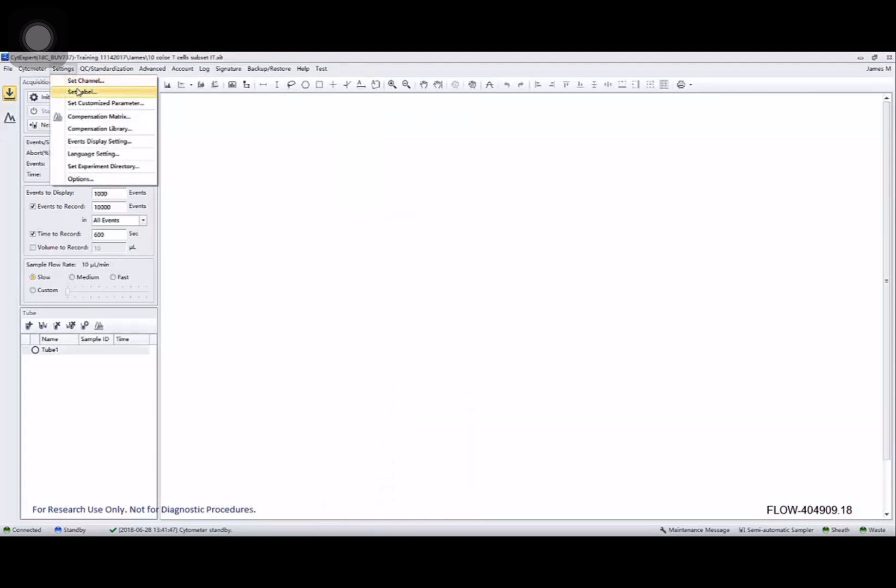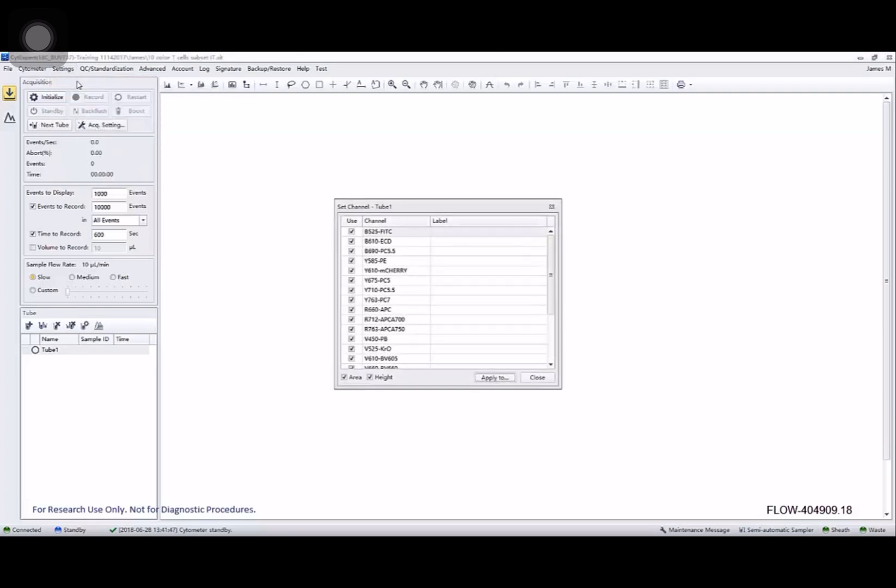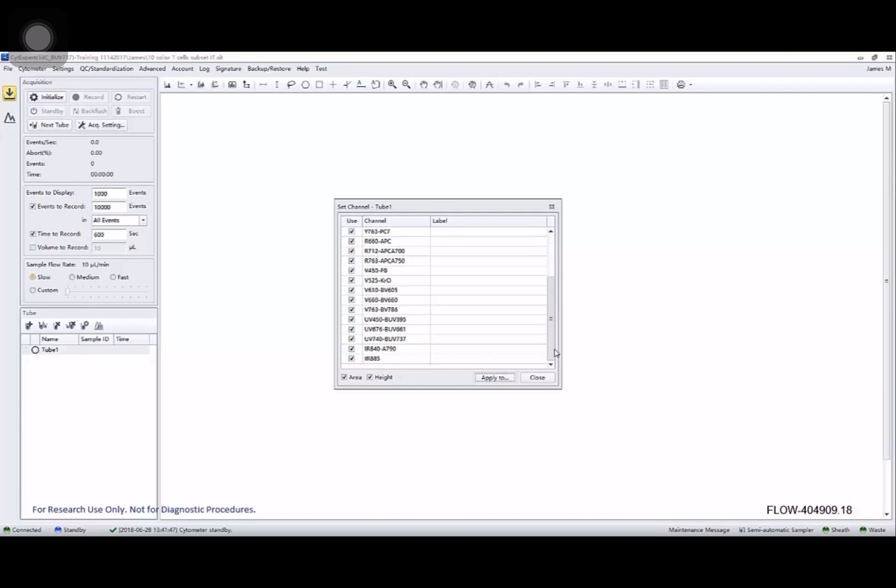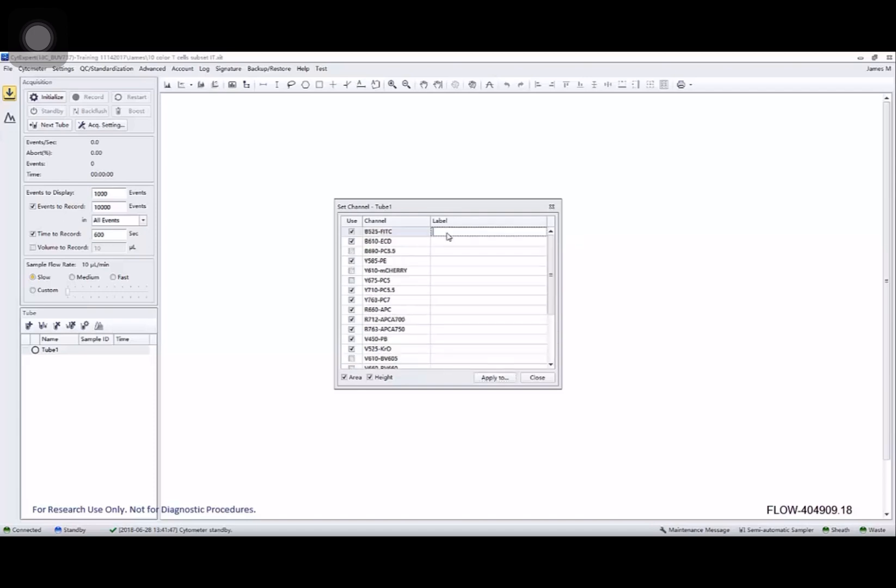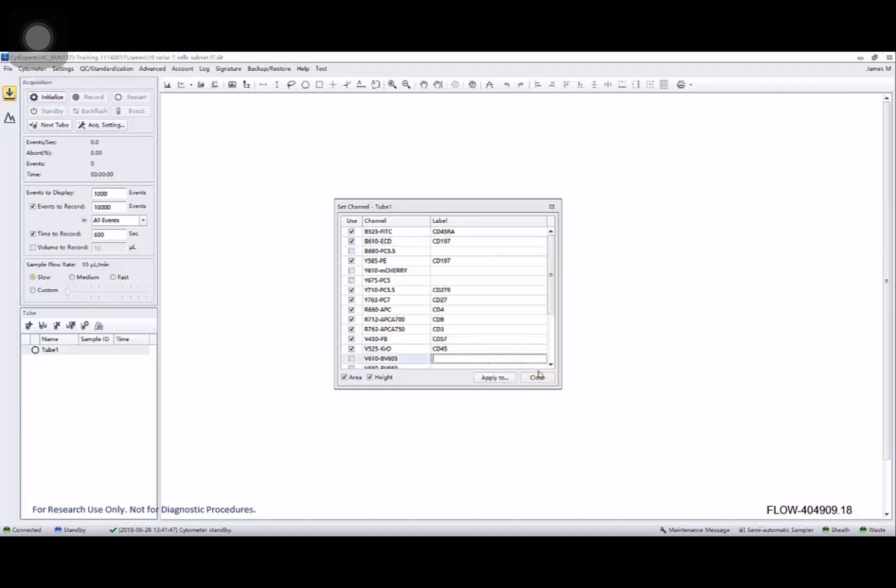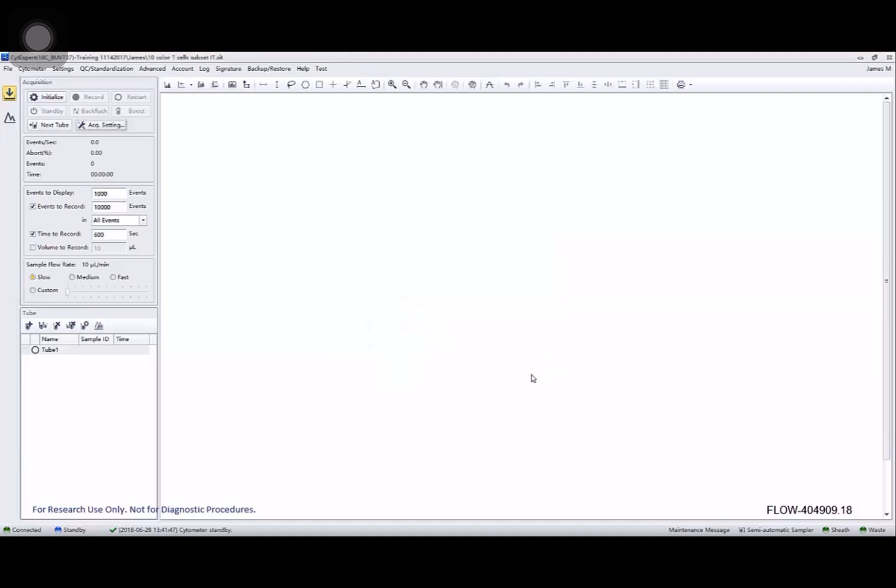And then I'm going to tell CytoExpert what channels I'm using for this experiment. Unclick things that I'm not using and then fill in the labels for the channels I am using.